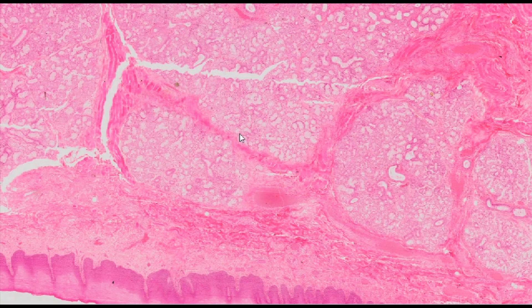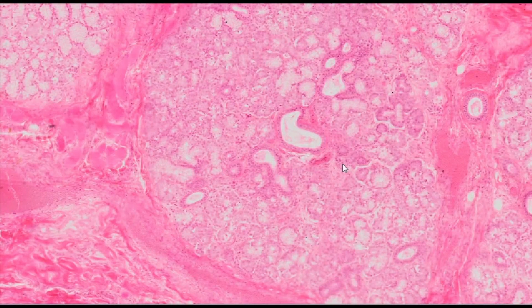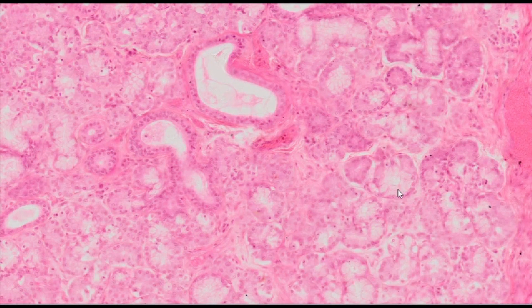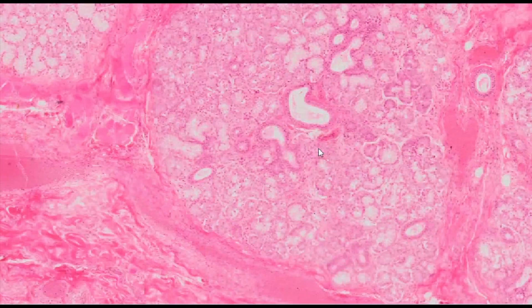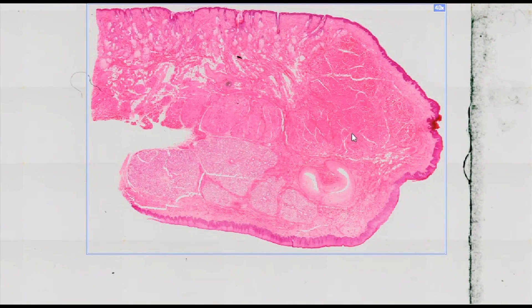Labial mixed mucocerous glands are found in the lamina propria. Multiple secretory sections are visible — both brightly stained mucus elements and dark serous ones. We can also observe secretory sections reaching the mucosal surface.